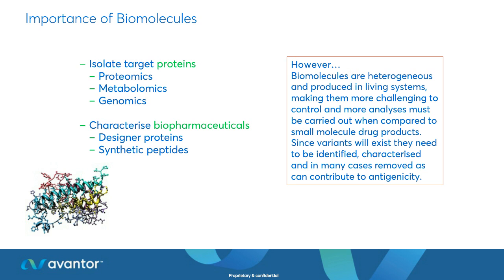We need to look at degradation products like we would for a small molecule analysis, processing variants. And when you've got these really complex mixtures, you don't just have a handful of processing variants, you can have hundreds or thousands of different variants, especially if you're working with very large molecules. So very small changes in that basic amino acid structure of a protein can affect the safety and the efficacy of a drug. So it's imperative that we monitor any changes.